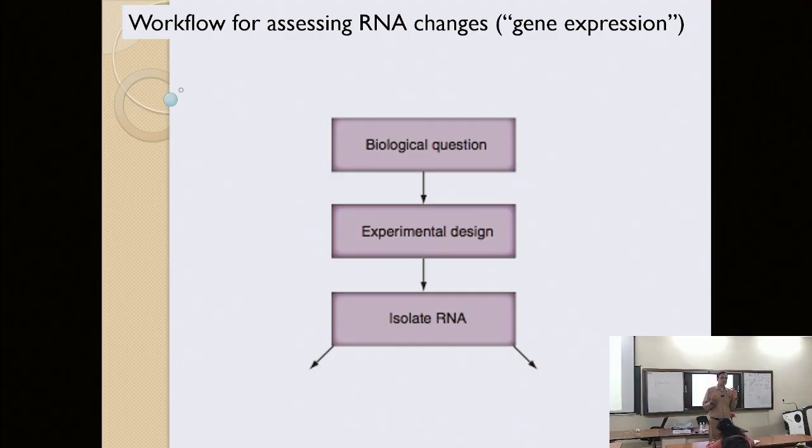So at different times, or maybe the same region, but get it in triplets. So three times you get 3 samples, and then 3 samples from healthy individuals. Okay, so that is experimental design.